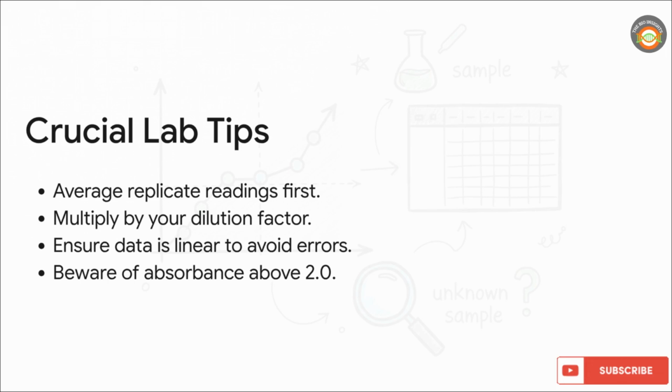Third, ensure your data arrays are equal in length and linear. Otherwise, Excel is going to throw a #VALUE or #REF error at you. And finally, beware of excessively high absorbance readings. Anything above a 2.0 on a spectrophotometer is generally just not reliable.